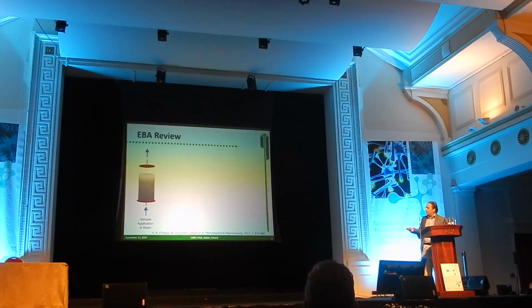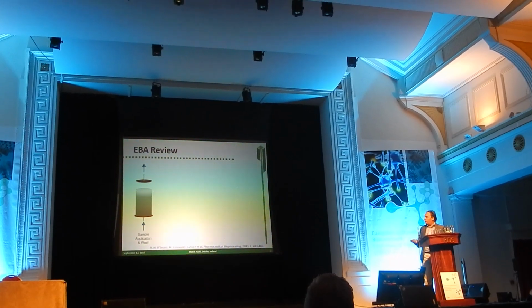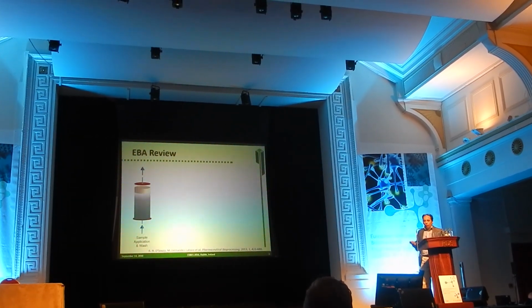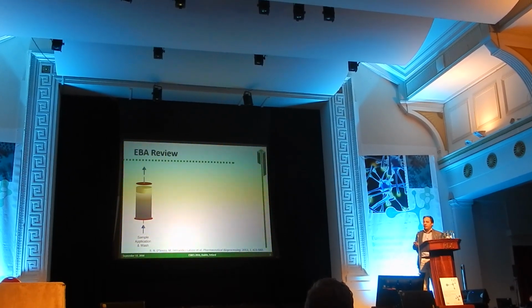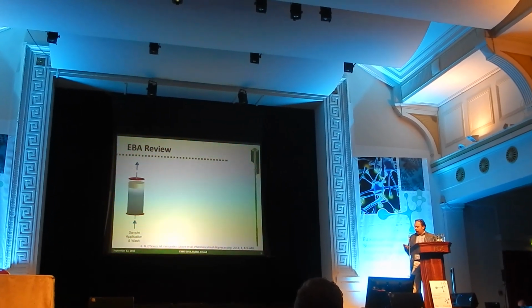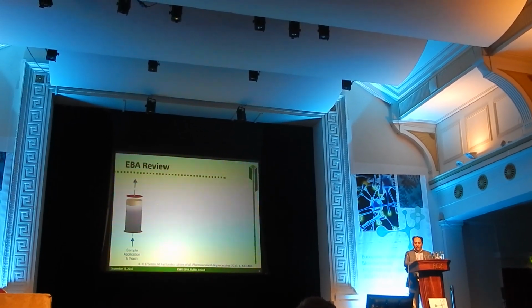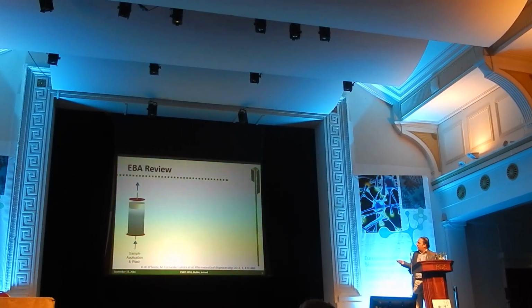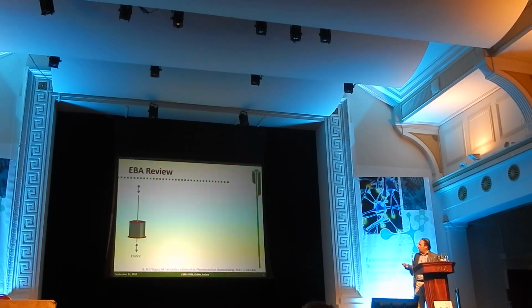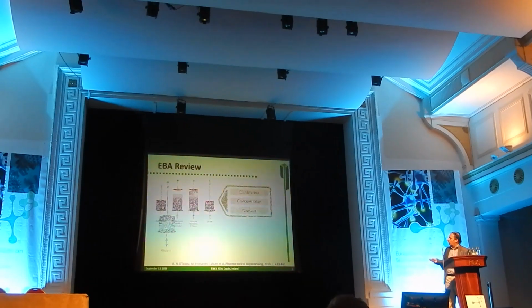The advantage of this is that we can then introduce a feedstock. This feedstock is actually a crude feedstock, so it contains cells in suspension, or particles in suspension, or biological particles in suspension. Those biological particles are going to be elutriated out of the system because there is a space between the adsorbent particles inside the system. They are going to leave, and then after washing, you could repack the column or just go for an elution in an expanded bed mode, perhaps using a little lower flow, right?